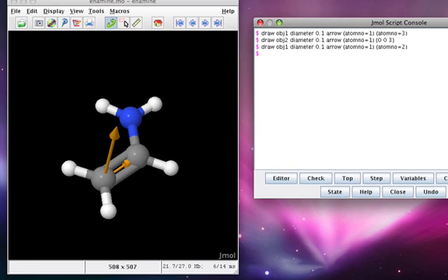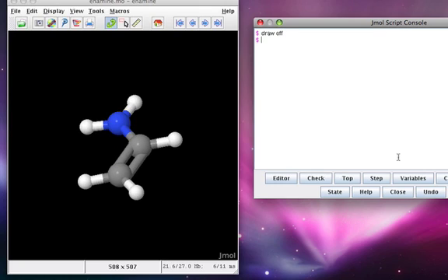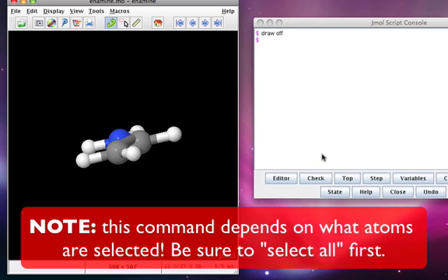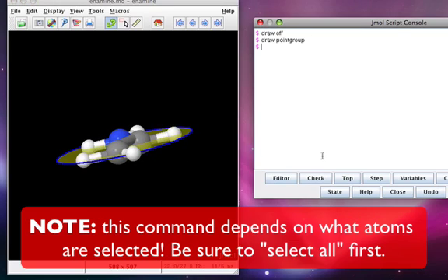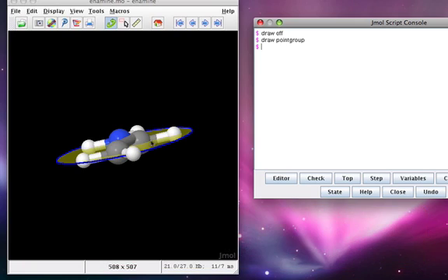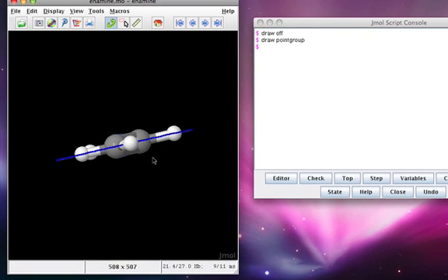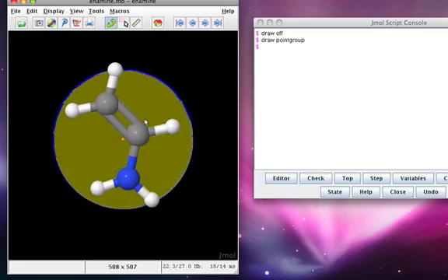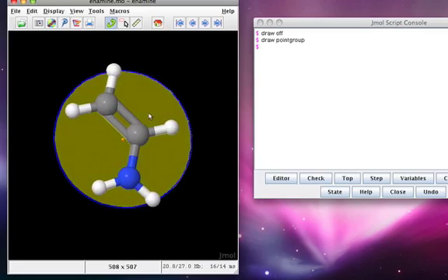To turn drawn objects off, just type draw off. Let's see if using draw point group shows us the plane of symmetry inherent in the enamine. And sure enough, there it is. Notice that we can reflect through that plane and get the same molecule out.